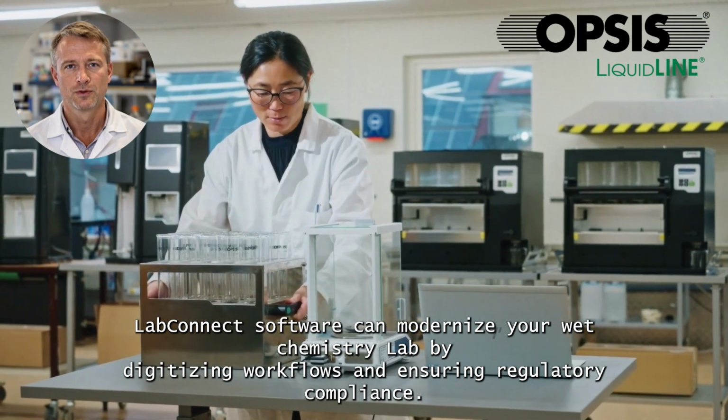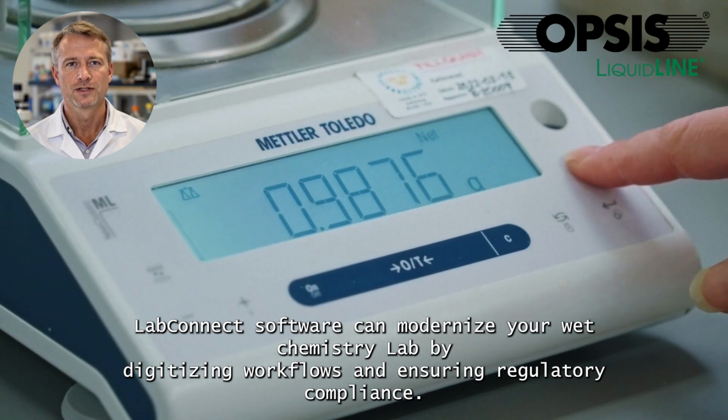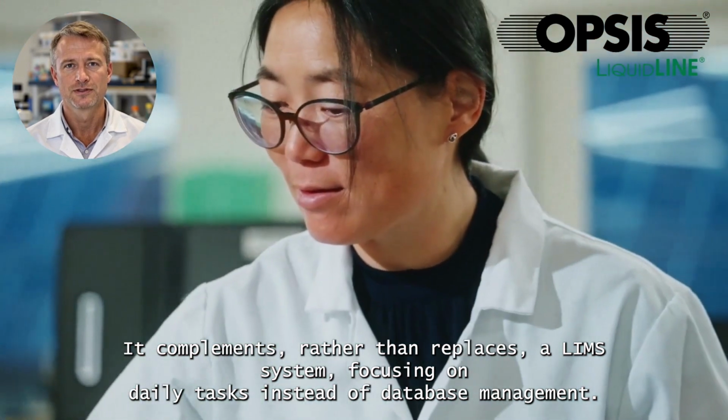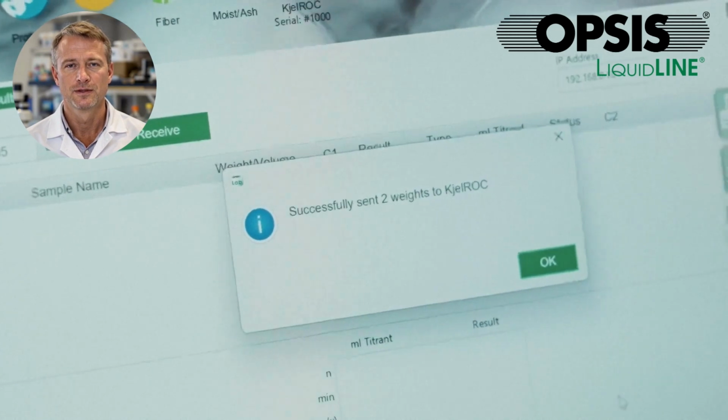LabConnect software can modernize your wet chemistry lab by digitizing workflows and ensuring regulatory compliance. It complements, rather than replaces, a LIMS system, focusing on daily tasks instead of database management. Here's how it can help in the daily work.